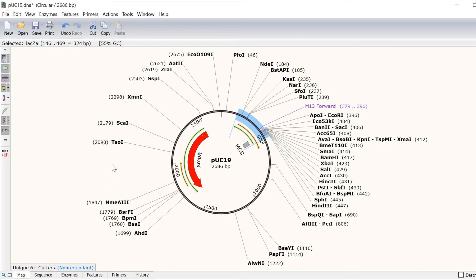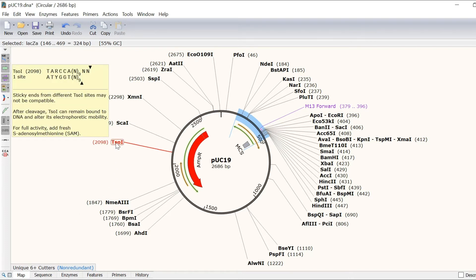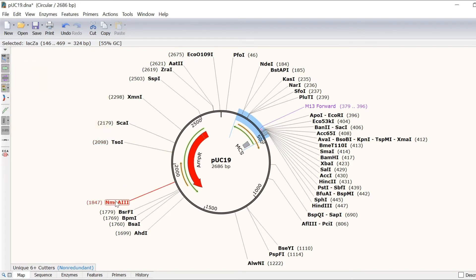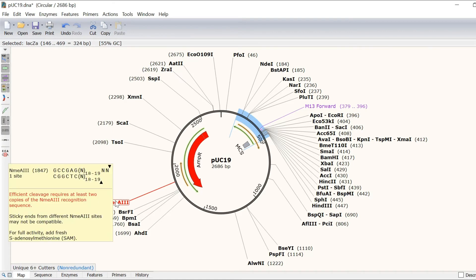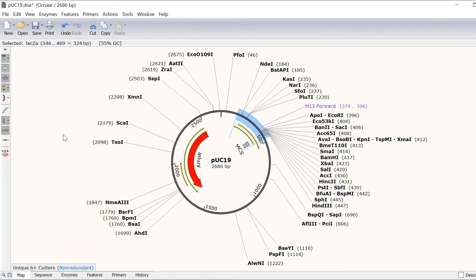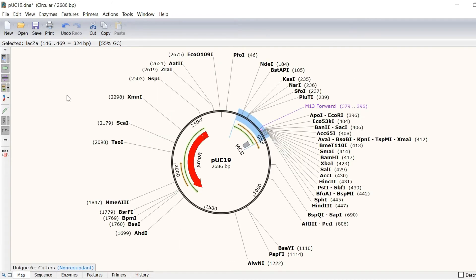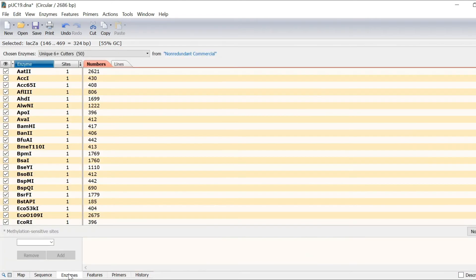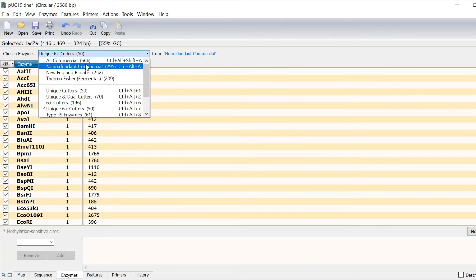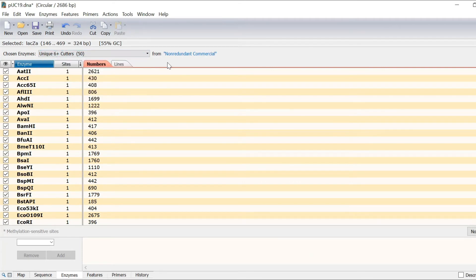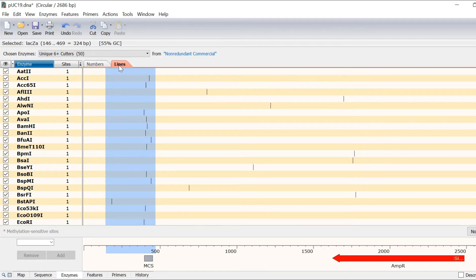Visualising restriction sites in DNA sequences is intuitive with Snapgene. Restriction sites are clearly displayed on or off with the click of the show enzymes button. In the enzymes tab, you can choose from a range of enzyme sets or use your own enzyme set. Cut sites can be displayed as numbers or lines and sorted by name or frequency.